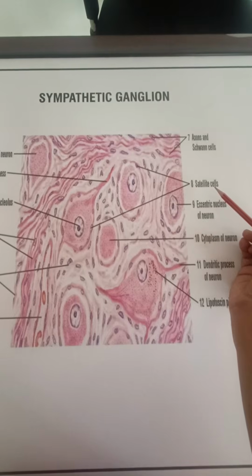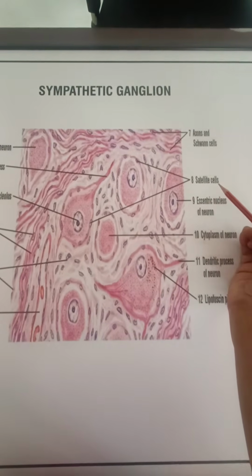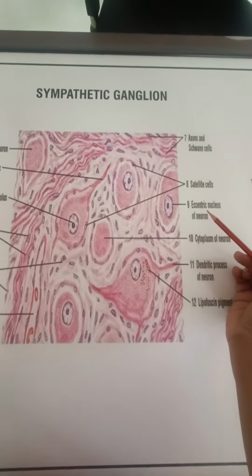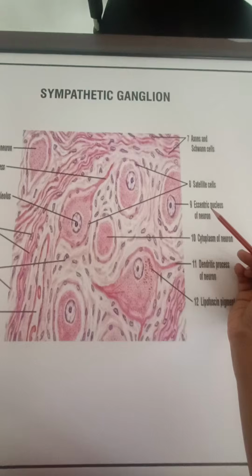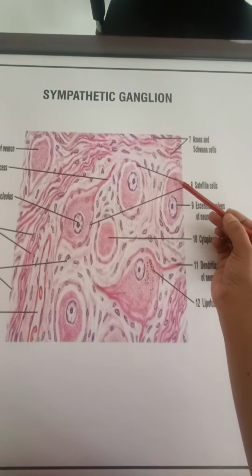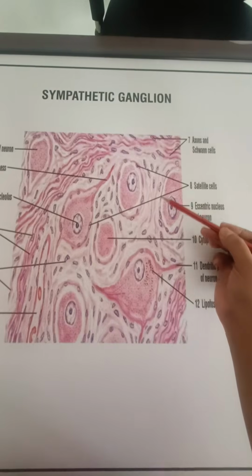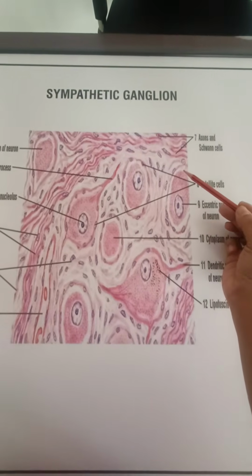They are mostly seen in skeletal muscle repair. So that is the function of satellite cells in the PNS. Whereas in CNS, you can call them as astrocytes. So here they are present not in a complete ring. They do not form a complete ring. They are scattered here and there.